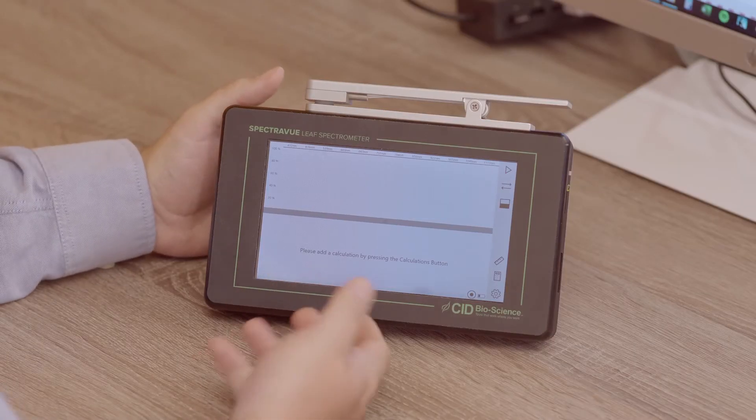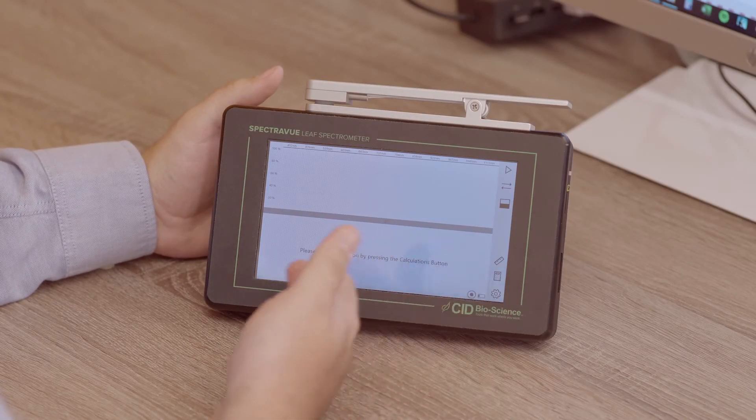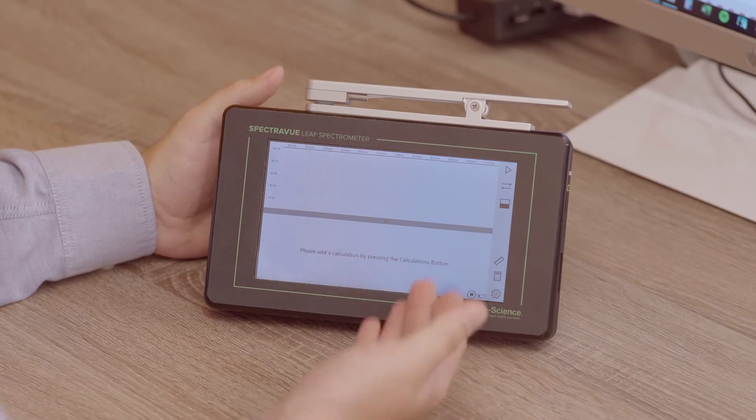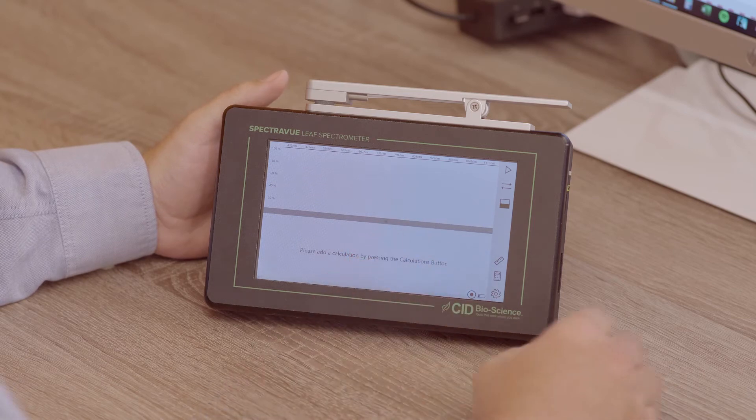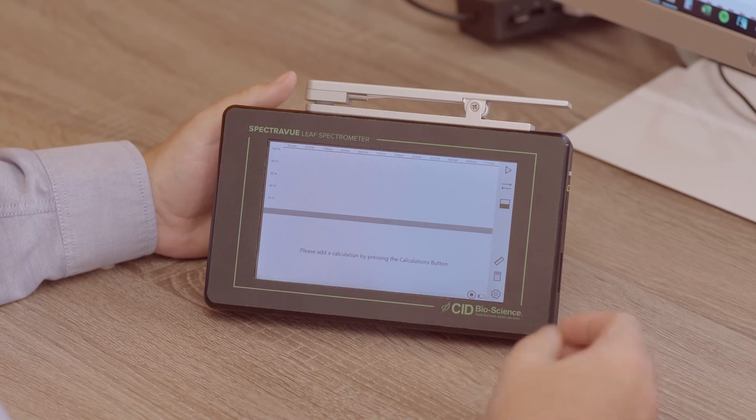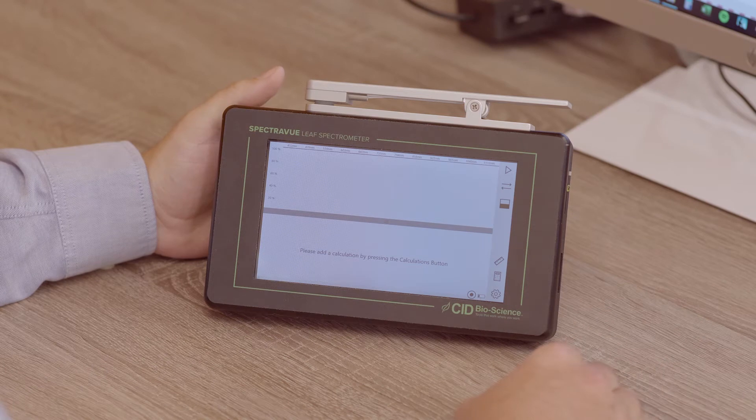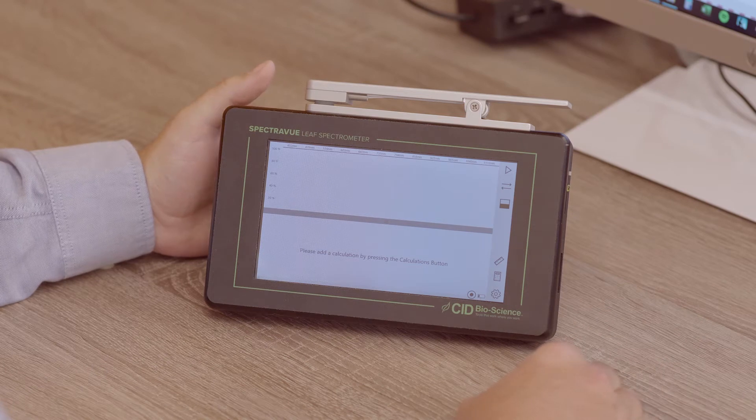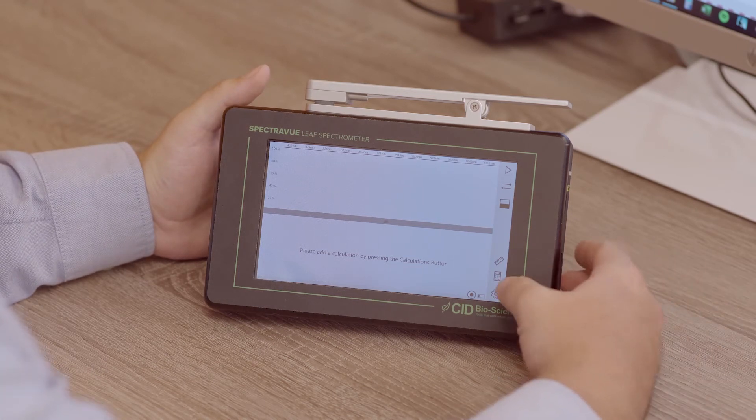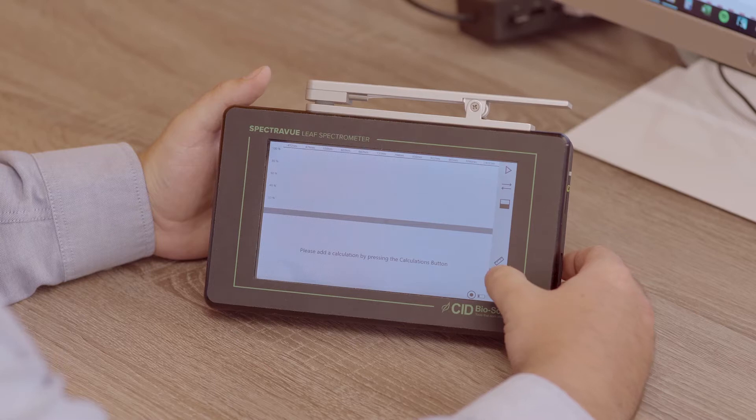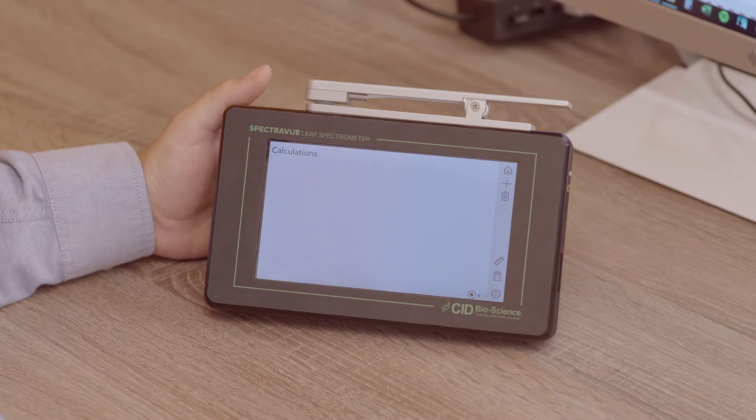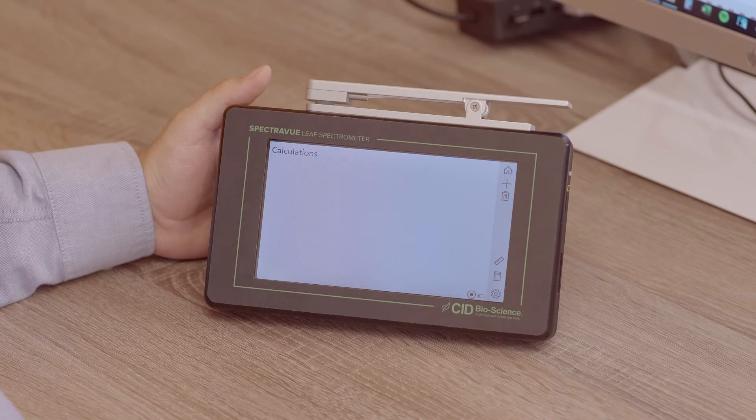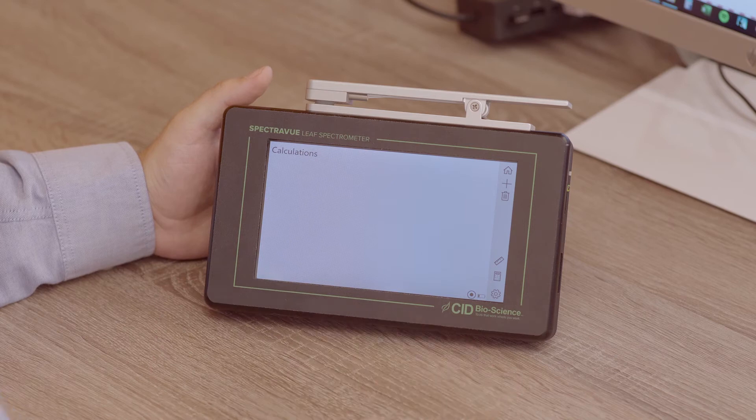When you power on the SpectraView, you'll see a split screen that's blank. There's a top half that is a spectrograph and a bottom half that says please add a calculation by pressing the calculations button. The calculations button is denoted on the bottom right with a calculator, so when you click that it'll take you to this blank calculation screen.